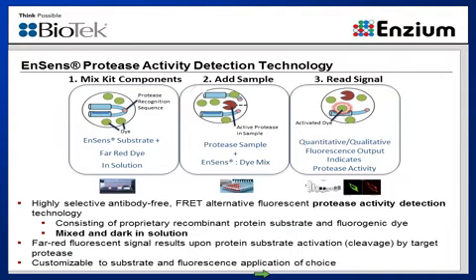Moving on from the initial invasion analysis, we also performed 2 different types of mechanism of action studies, as not only is it critical to examine the phenotypic invasive properties of cells and the interruption of that invasion, but it's also important to evaluate the different enzymes and binding activities that could potentially be involved in the invasion process. The first that we're showing here involved monitoring the activity of matrix metalloproteinases, or MMPs, that have been shown to play a role in the tumor invasion process.